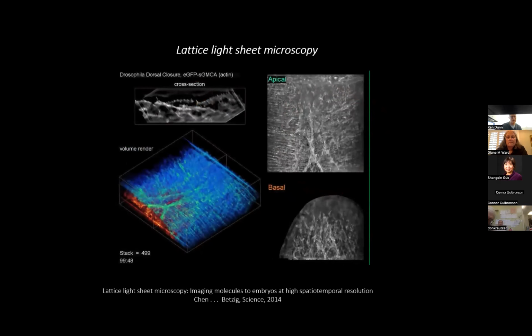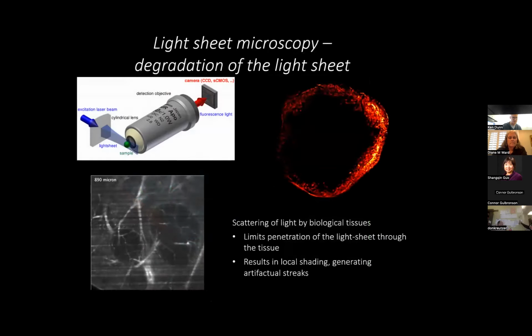And in fact, one of the things he goes into that I took out of my talk was the analysis: following individual objects, and I think it was microtubule endpoint markers or something, over time. But again, the whole business of analyzing this much data with this much complexity and motion is mind-boggling, and I think it's probably the next frontier of this work.